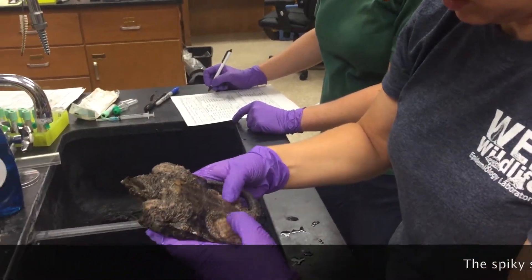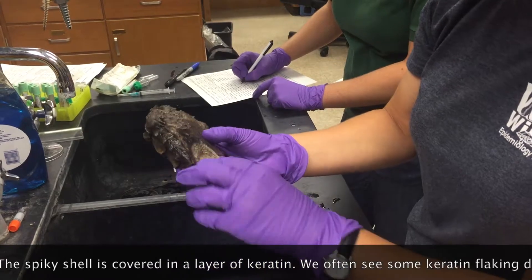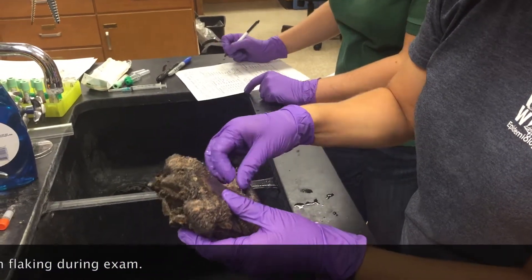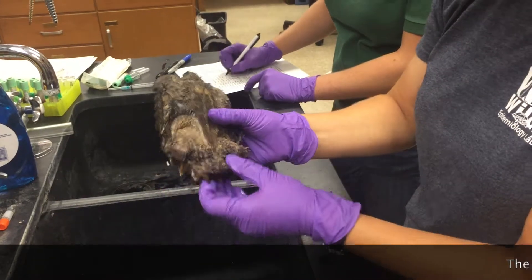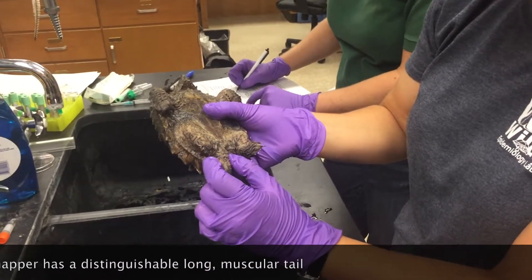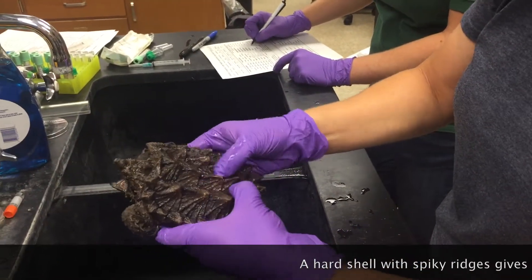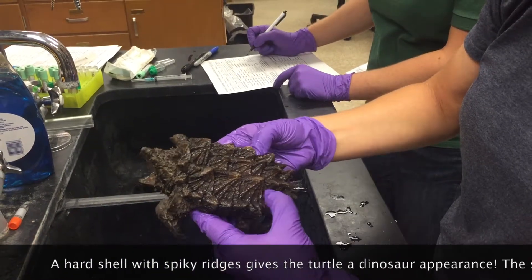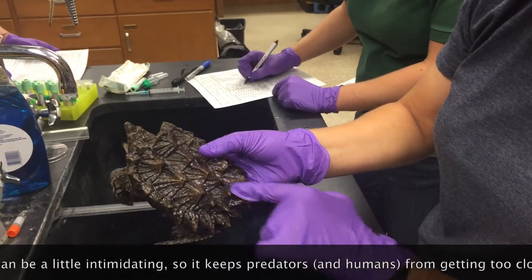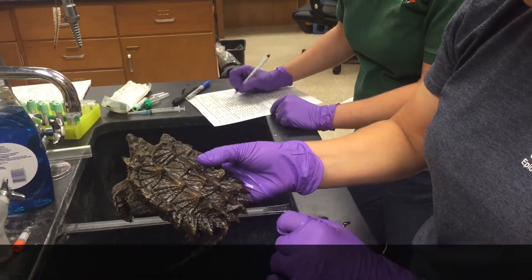We're going to look at the tail. We'll look at the bottom shell, the plastron, and make sure that they've got all their keratin. He's missing a little bit of keratin on the bridges of his shell, so we'll make a note of that. We're going to look at the back feet for lumps, bumps, or wounds and make sure he's got all his toes — those look great. He's missing just the tip of his tail. Then we're going to look at the cloaca, which is the outlet on a turtle, which looks pretty normal. Finally, we'll look at the top shell, or the carapace. We'll feel for any abnormalities, any soft spots. He's got some flaking of the keratin on the carapace, and he has too many vertebral scutes — he has six, and he should only have five. So we'll make a note that he has an extra vertebral scute.